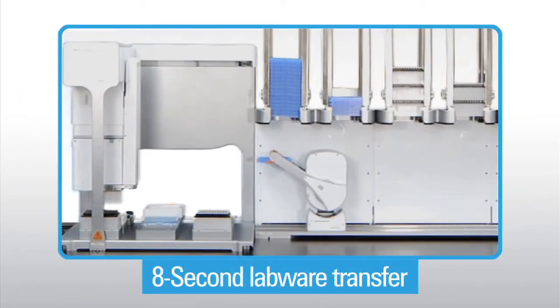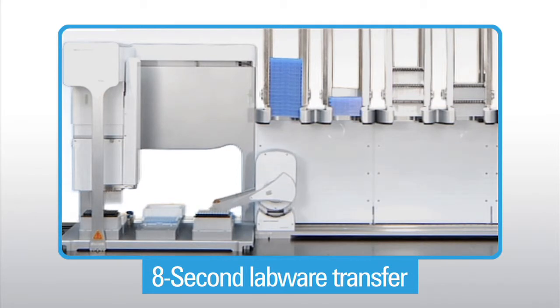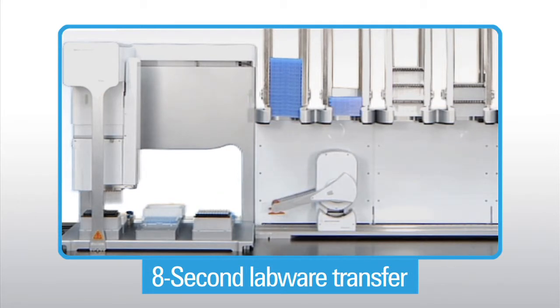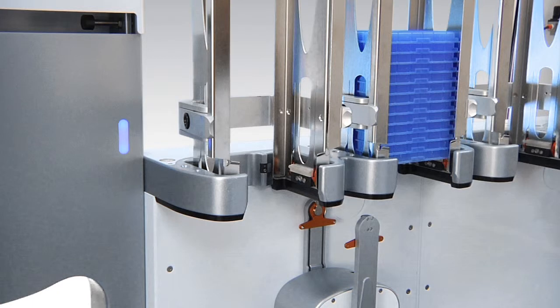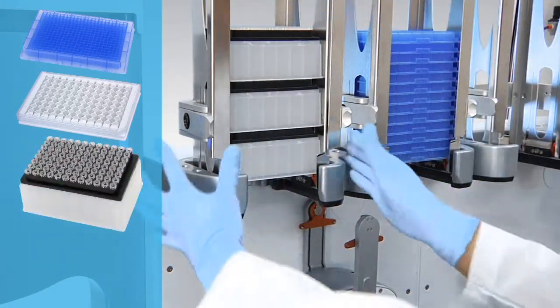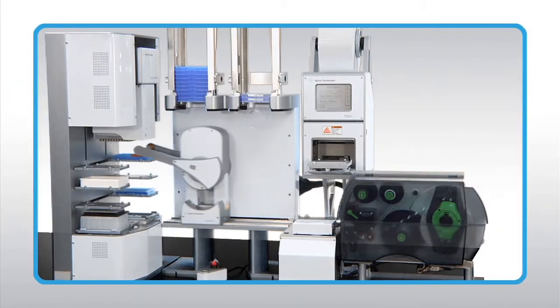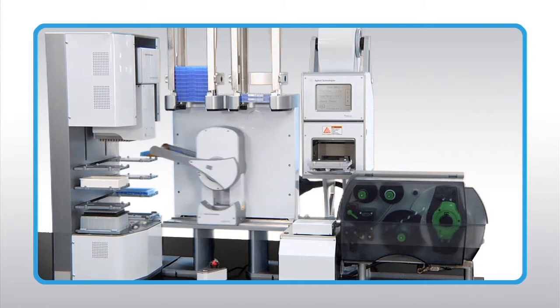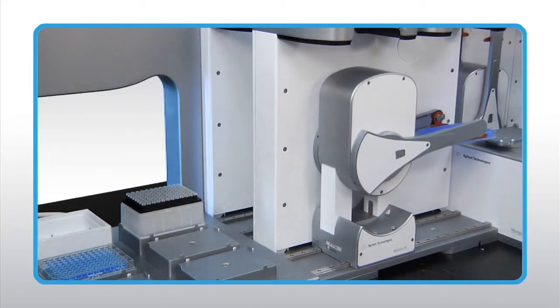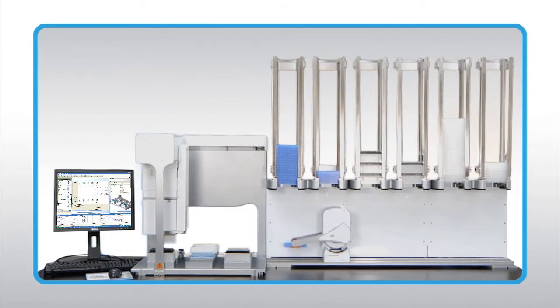The high-speed BenchCell robot is capable of eight-second labware transfers from any of the labware racks to an adjacent instrument. Compatible labware includes microplates, lidded microplates, tip boxes, and tube racks compliant with labware standards. The BenchCell robot's unique motions and vertical travel allow it to repeatedly access labware in high-density locations for the most efficient space utilization.